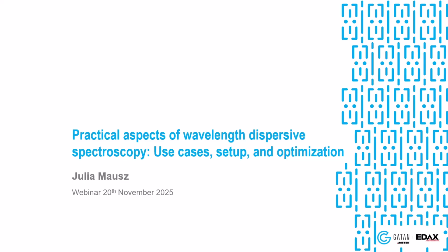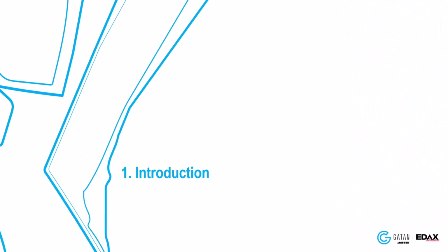Thank you, Michaela, for the kind introduction, and welcome also from my side. Today, I would like to talk about the practical aspects of wavelength dispersive spectroscopy, or WDS in short, and we will look at use cases, setup, and also at optimization.